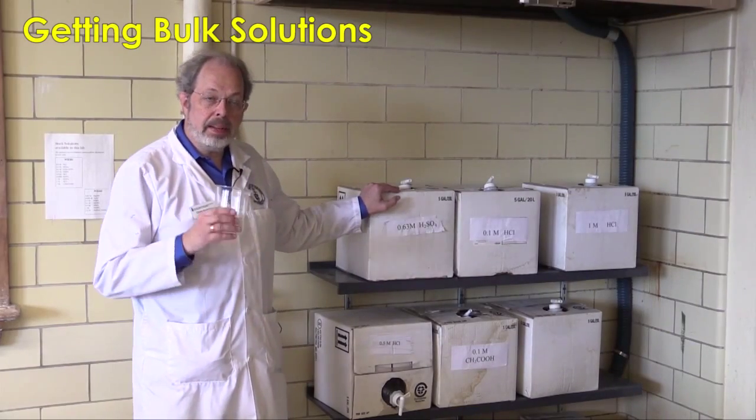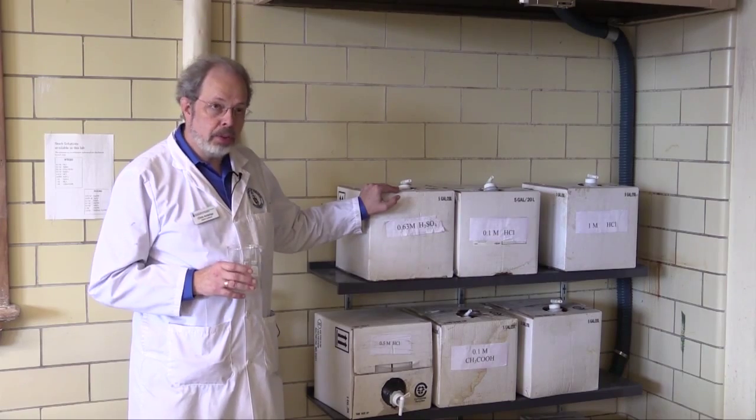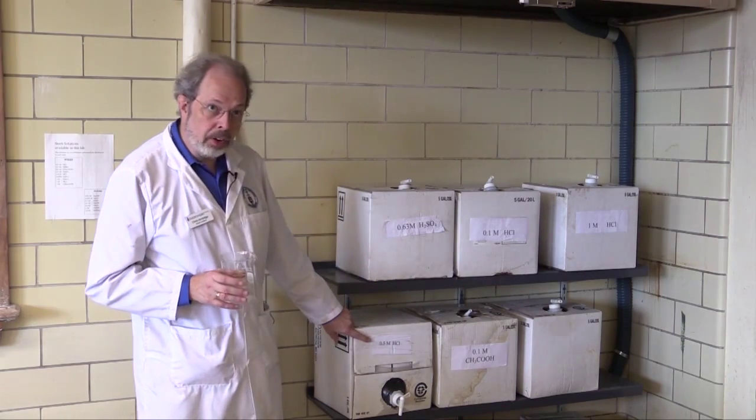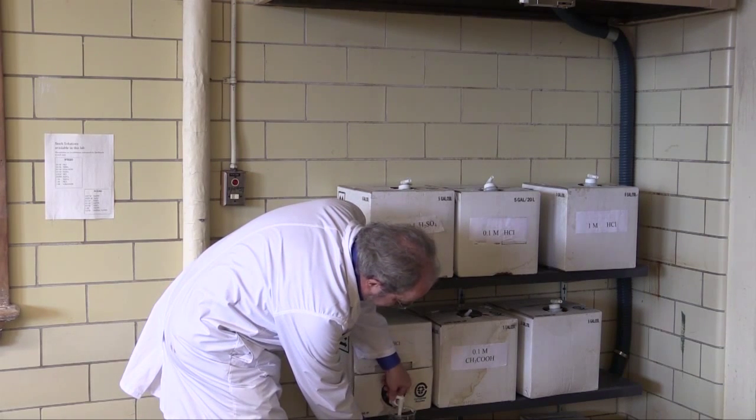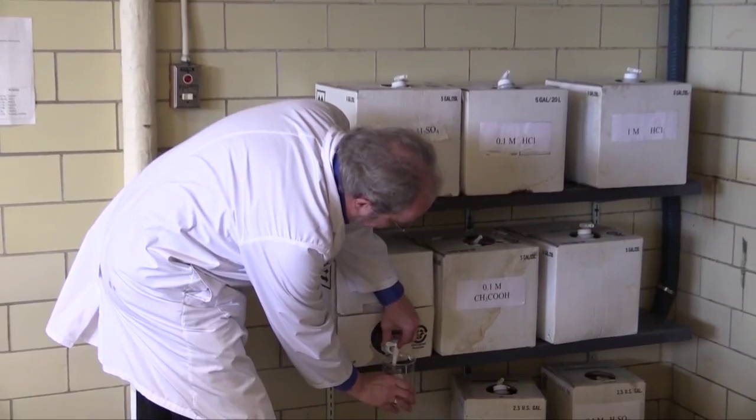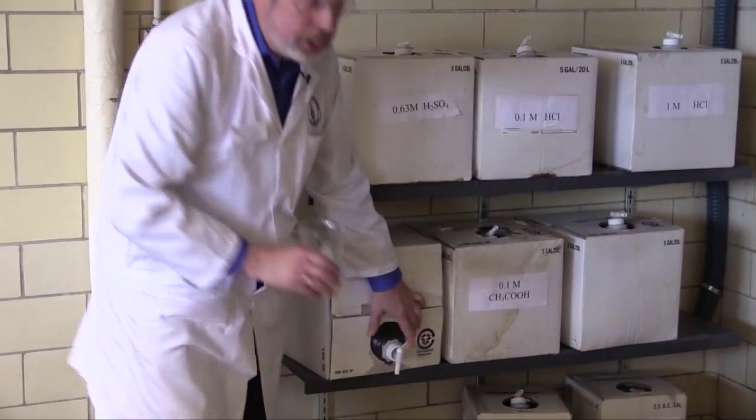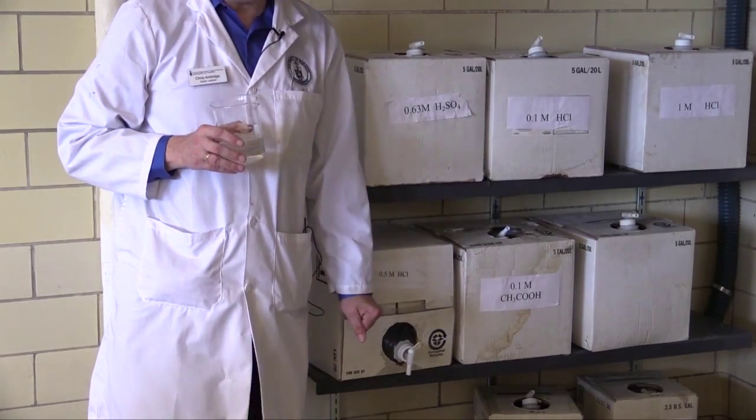The acid that you will need is in cubitane, as here in Wahlberg 203. You'll be using 0.5 molar hydrochloric acid. So take the appropriate amount that you need. And please be very sure that you turn it off before you leave. Otherwise, we have a flood.